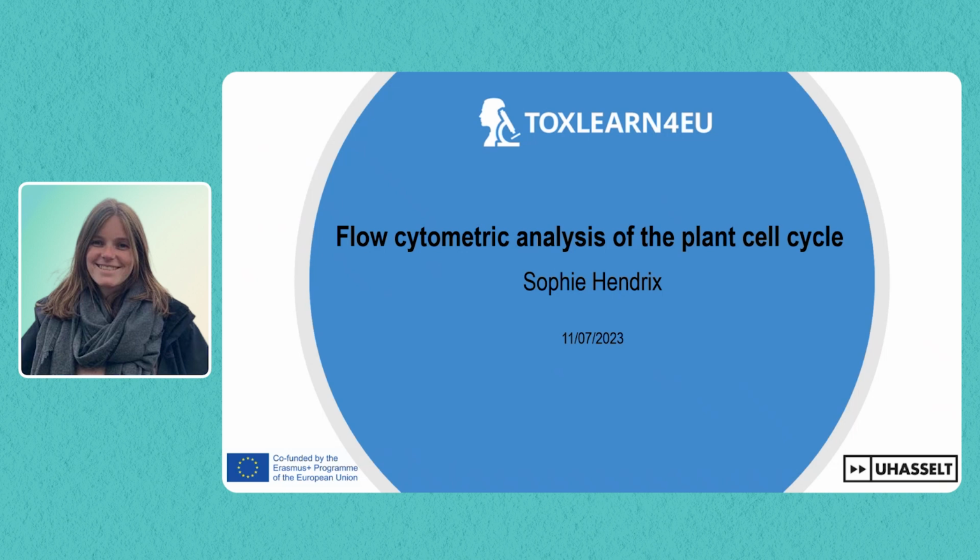Okay, thank you. So Carla already gave an excellent introduction on flow cytometry, so I think I can really skip most of the basics. But today what I want to talk to you about is how we can use flow cytometry to analyze the cell cycle. Carla already mentioned that this is also one of the applications that you can use flow cytometry for. But we specifically do this in plants. So in my research, I'm working on the model plant Arabidopsis. So I will show you some of this application today.